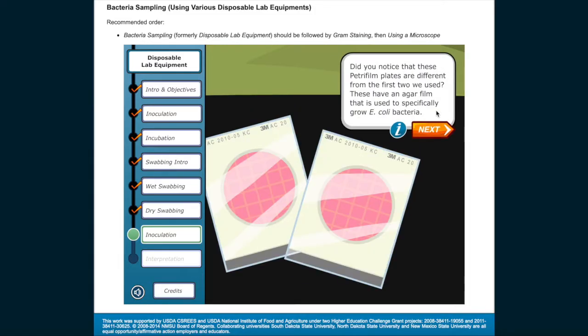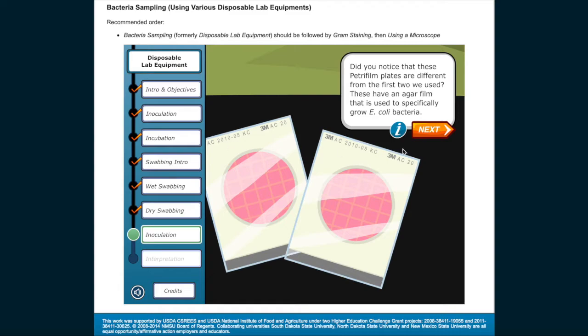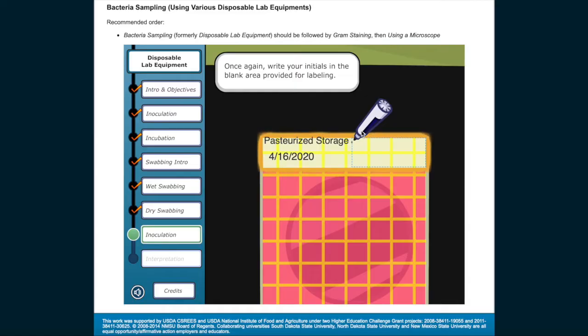Did you notice that these Petri film plates are different from the first two we used? These have an agar film used to specifically grow E. coli bacteria. Different bacteria require different nutrients to grow. Start by labeling the backside of your first Petri film plate with the date of the sample, where the sample is from, and your initials. Write your initials in the blank area provided for labeling.